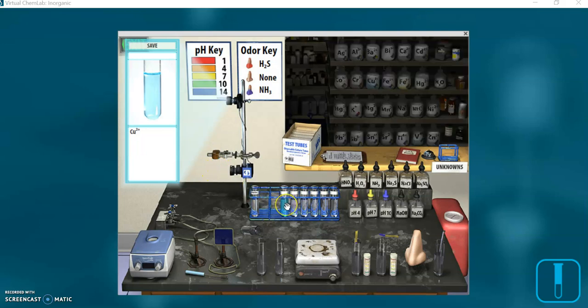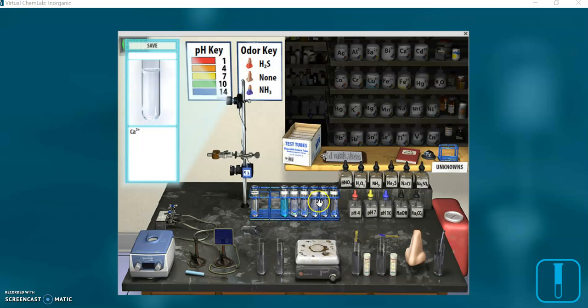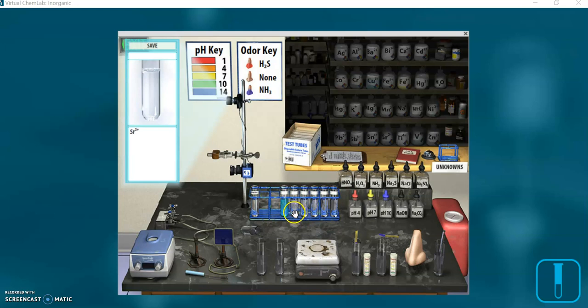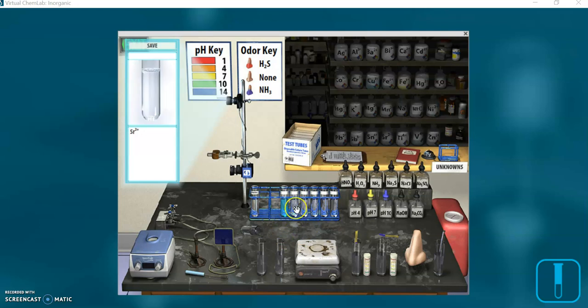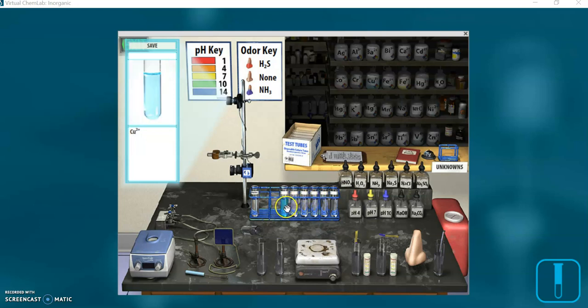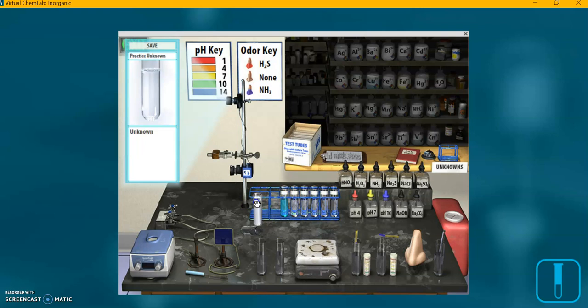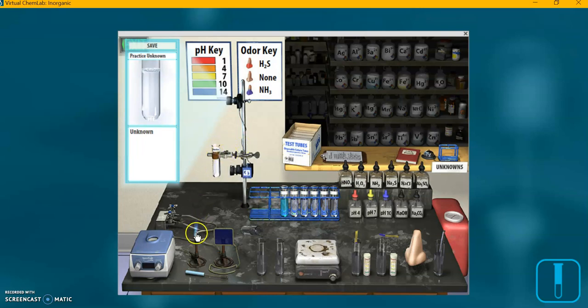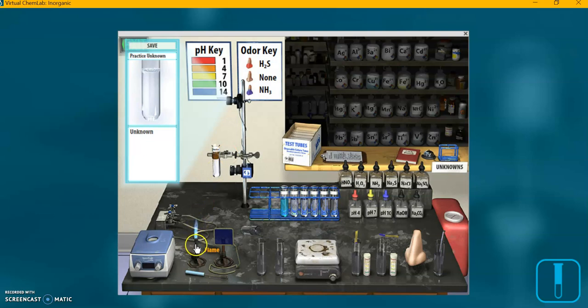Now your data table should be mostly filled out by now with the color of the flame of each of those. You can always repeat, just click and drag any test tube back there and repeat any test you want to get your data table filled out, and we're now ready to perform a flame test on the practice unknown. That's step eight of the Beyond Labs. I'm dragging the unknown test tube now over there, and we're going to try to figure out what's in there.